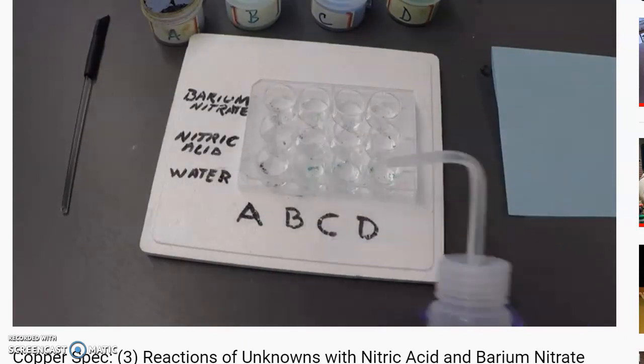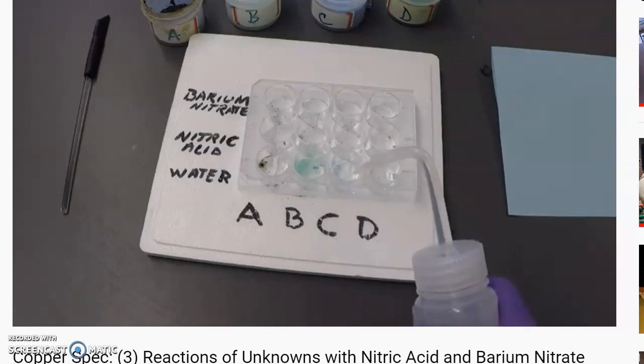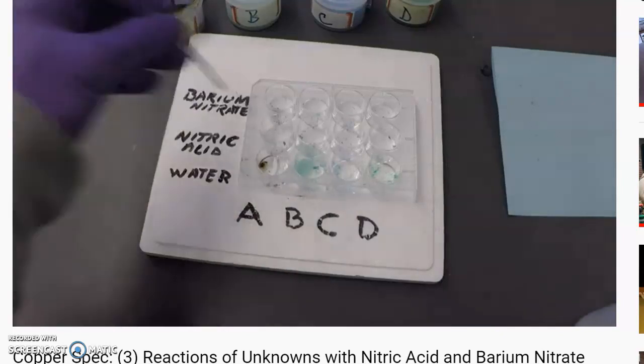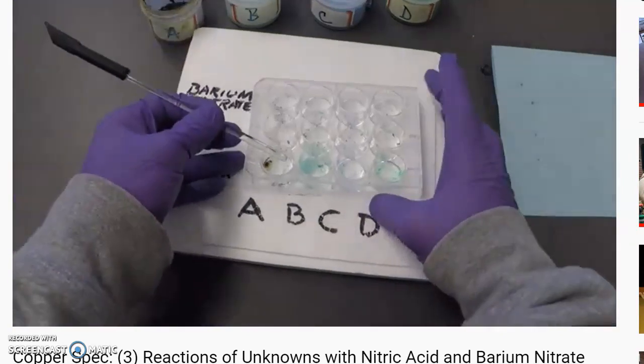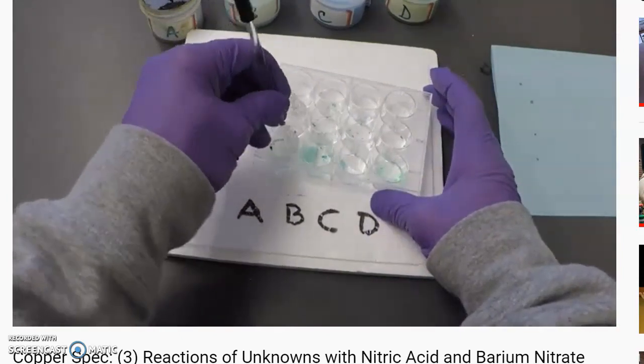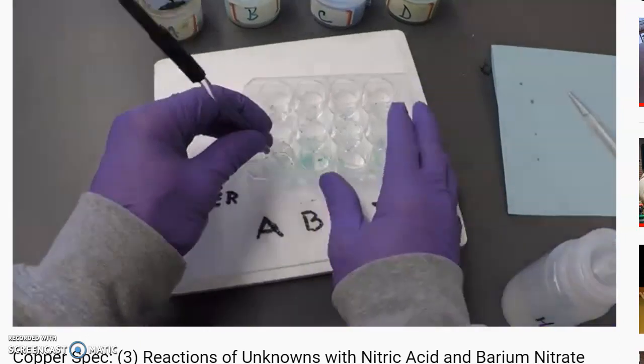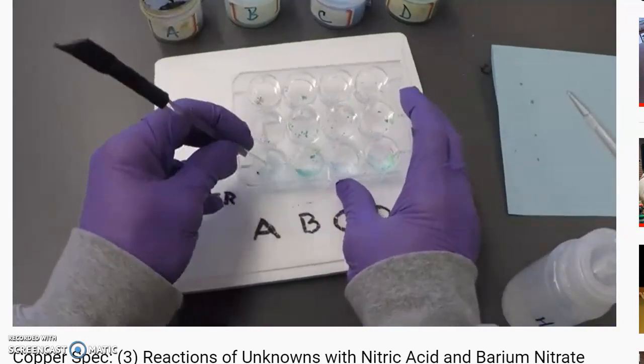So we're going to mix them with water first and see if all of them are soluble or not. And you have to mix them all up and see if they dissolve. Now, if they dissolve, it should create a clear, transparent solution. If it does not dissolve, then it will stay cloudy.